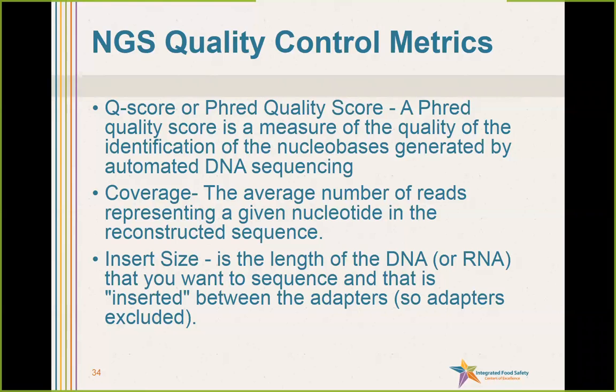Another quality control metric is the insert size, which is the length of the DNA that you want to sequence and that is inserted between the adapters.